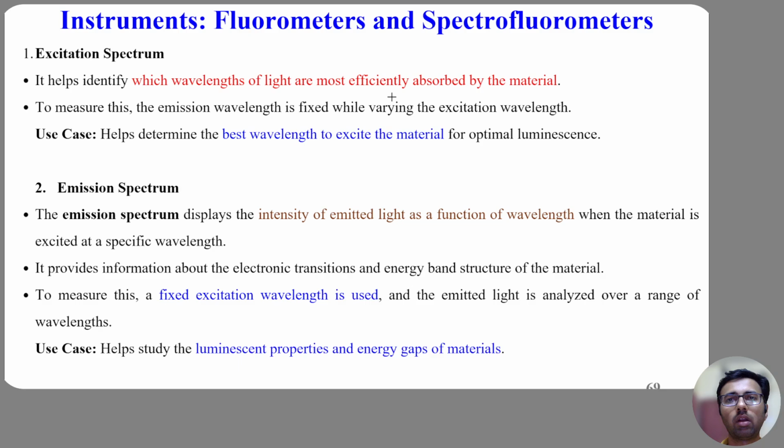The emission spectrum reveals internal electronic transitions, vibrational energy spacing and energy band structure. For physicists and chemists, this becomes the primary tool for studying quantized energy gaps in molecular systems.